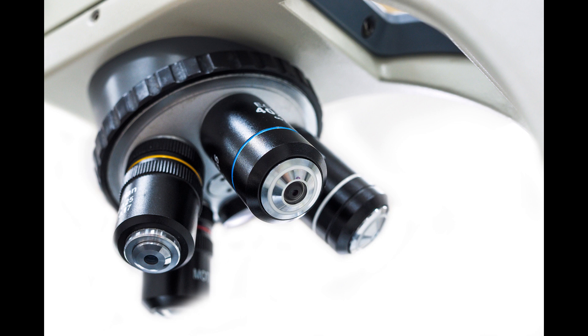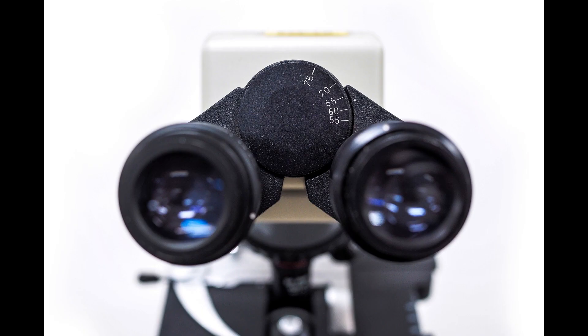Its magnifying power is etched on the side of the lens, which are 4x, 10x, 40x, or 100x. The eyepiece is the lens that you look through.